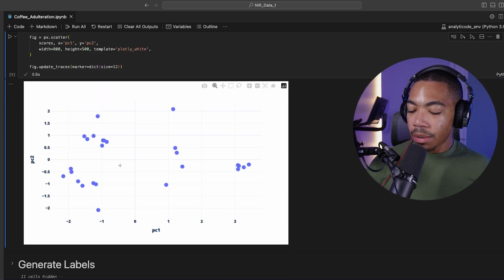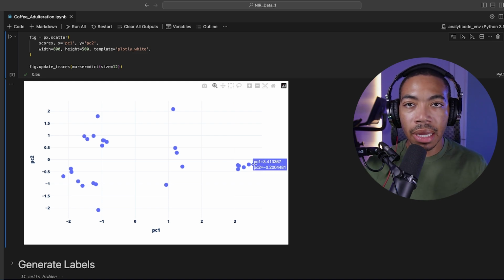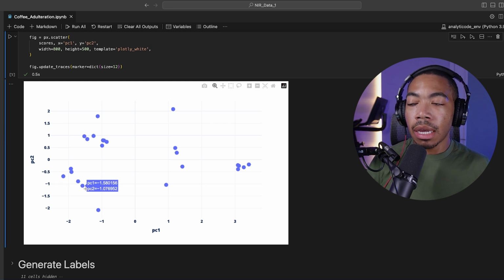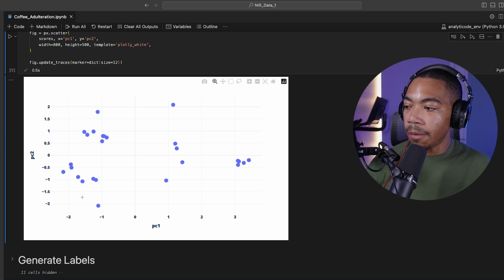If we look at that output, we can see that we have what looks to be 4 different clusters, one over here, which I presume will be our authentic coffee samples, but I have not applied formal labels to this data yet. And then we have our 3 other commonly used adulterants, or at least in this case, simulated adulterants, pure corn-based cereals or other grain materials, whole grain materials that we're just using in this study.